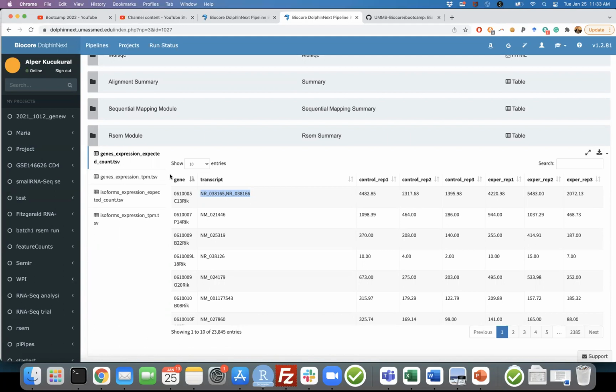This is important. I just want to underline that, because when I review papers, I see some publications using normalized counts and doing DE. You cannot use, for example, TPM counts and do DE, differential expression analysis, okay? This is a very important thing.